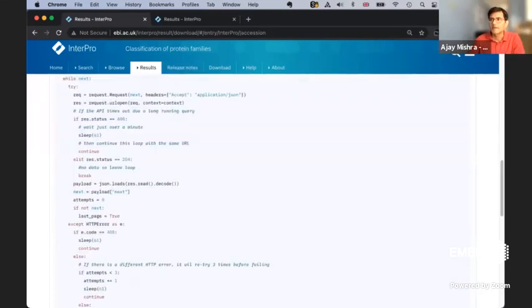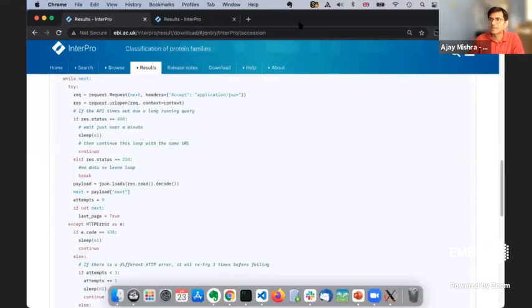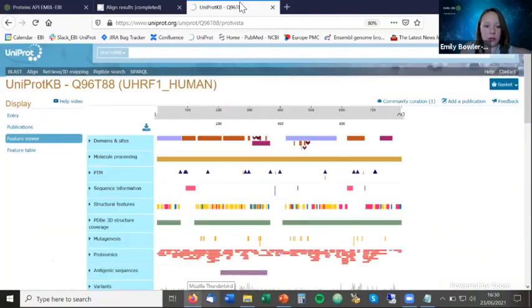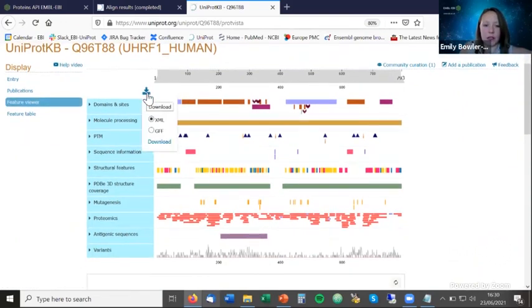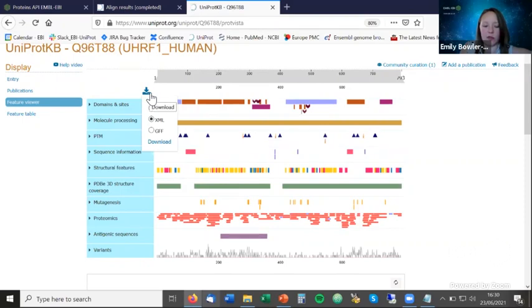On downloading specific features from the Feature Viewer: yes, there is a download button in the top left of the Feature Viewer offering JSON, XML, and GFF formats. You can download everything and then pick out the features you need, such as PTMs. Regarding getting a protein structure for your own protein sequence: at the moment InterPro does not provide structural models for sequences outside of InterPro.